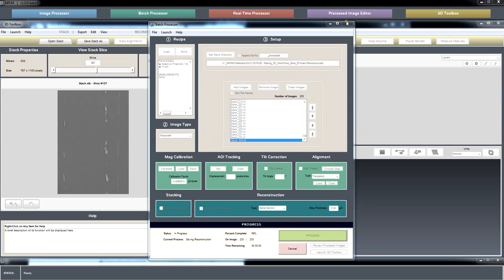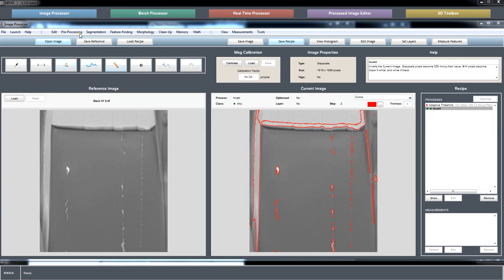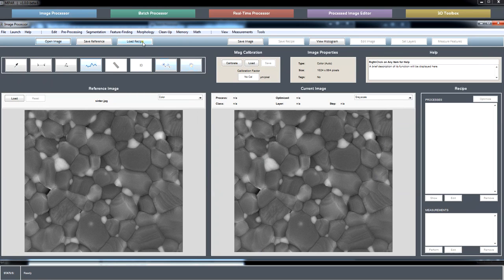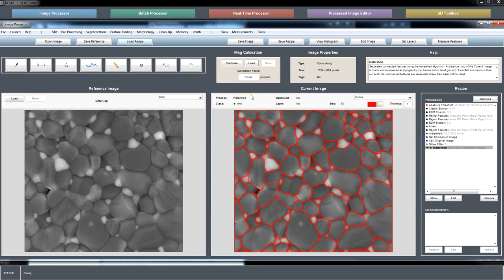I think they do have, if I remember, a pretty extensive filter list. Right, yeah, we can definitely support all of that now. Inside of your, if I go back to my example here, these grains. So you take your, okay. Potentially, yeah. If there's enough of a need for it, we can explore that.